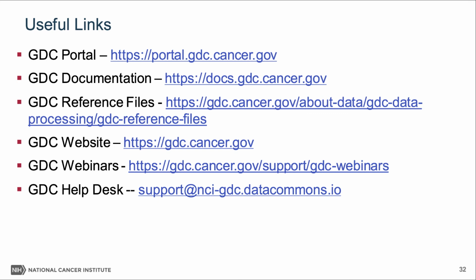It depends on which project and which specific subset of data. This can usually be figured out by which of the BAMs have corresponding VCFs and MAFs. Usually, if they don't have variants, it means that they either haven't been called yet, or there's not a matched tumor or normal, like it's only one or the other.